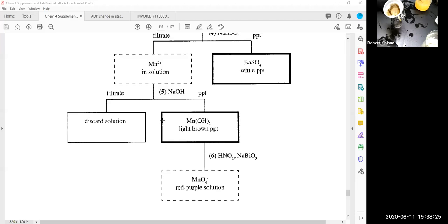Here's some 6 molar nitric. And you need a clean pipette. Let's go ahead and take some of this nitric here.